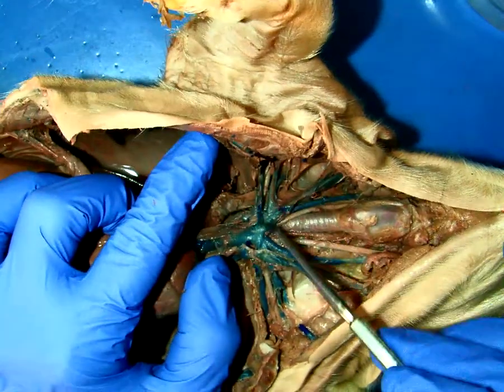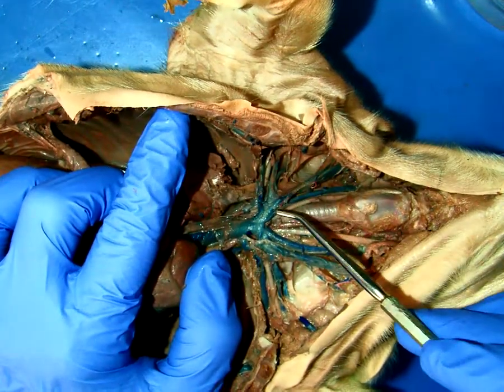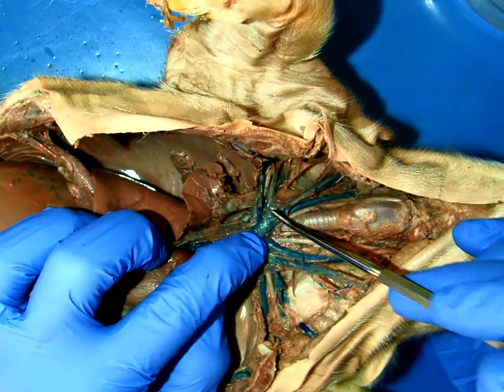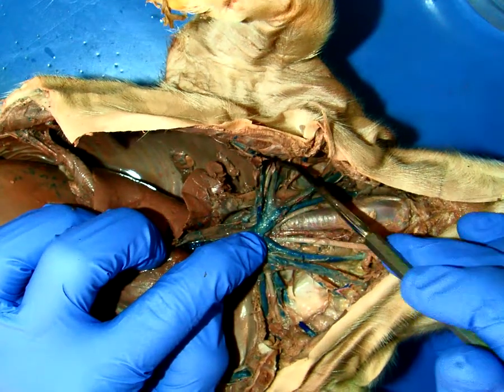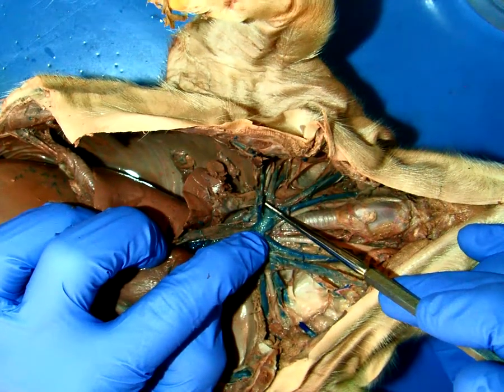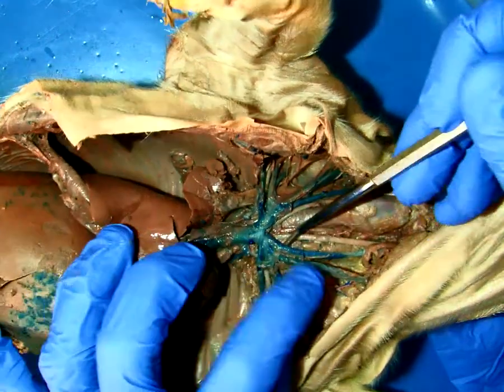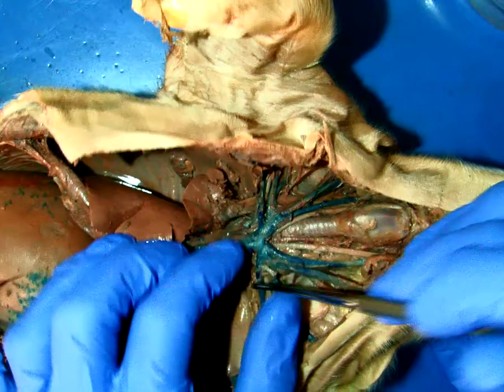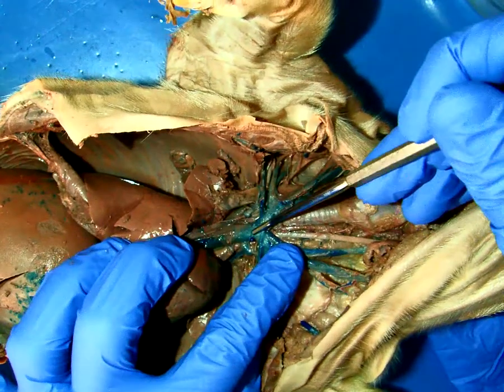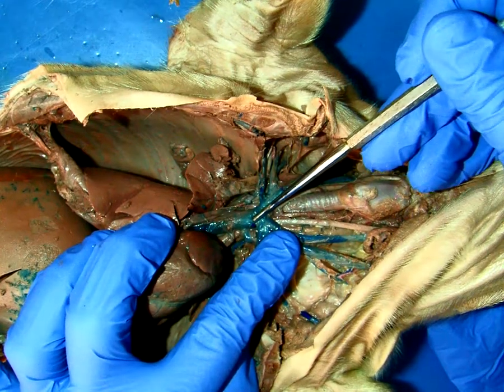So on each side, the head and arm, or forelimb for these guys, will converge into a brachiocephalic. The right brachiocephalic is probably between my fingers here. So here are the jugulars and the subclavian coming together, and that should be the right brachiocephalic vein. On the left side, we should see the jugulars coming together here, and the subclavian coming in. Sorry, there's connective tissue. The left brachiocephalic would really be right there between my probe and finger as they converge.